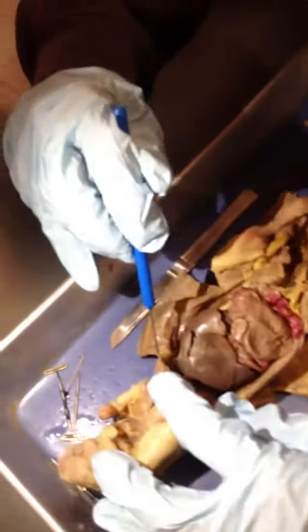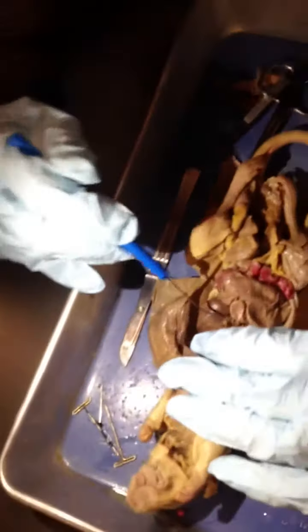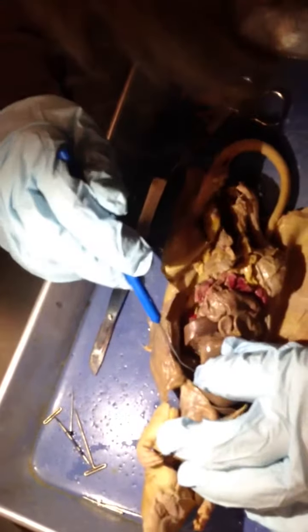So this is the diaphragm. This right here, these are the lobes of the liver. You need to know this is the part of the stomach that's not going anywhere, is the fundic part.